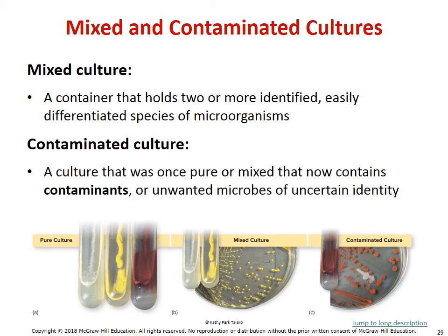With a contaminant, you can see it is typically a lone or very few isolated little pop-ups that happen in what would normally be considered to be a pure culture. I do want to point out most contaminants that you will encounter will typically come from the air. And so it's very crucial that while you're working with media you keep the media closed as much as you possibly can to eliminate those airborne contaminants.